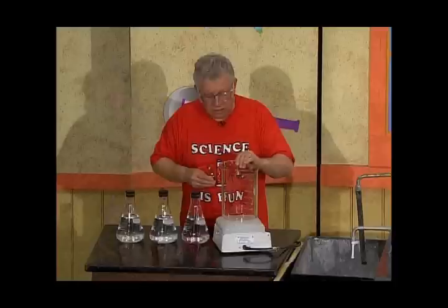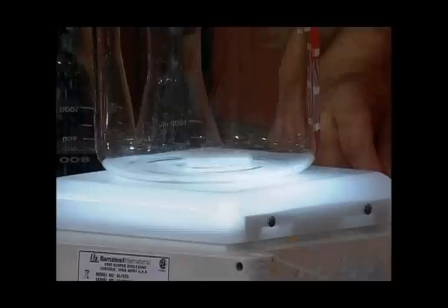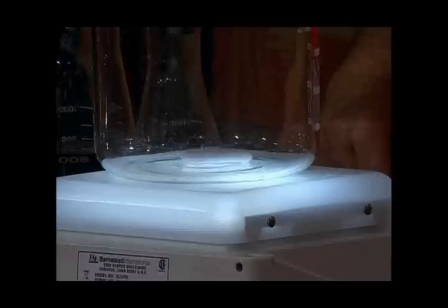Into this large beaker, I'm going to put a magnet coated with Teflon. And then I'm going to turn the light switch on so we can see it a little bit better. And then I'm going to turn the motor on so the magnetic bar is spinning. Can you see it spin? Is it spinning in a clockwise direction or counterclockwise direction? Clockwise, if we're looking down at it. What I want you to do now is something we always do in science. I want you to visualize this.